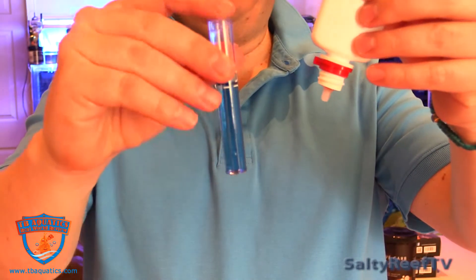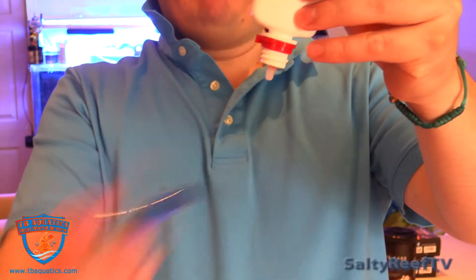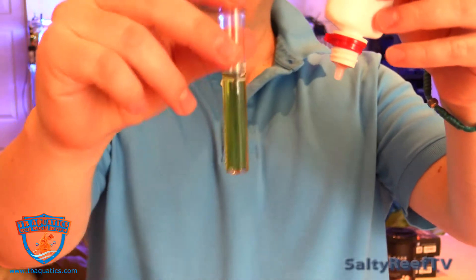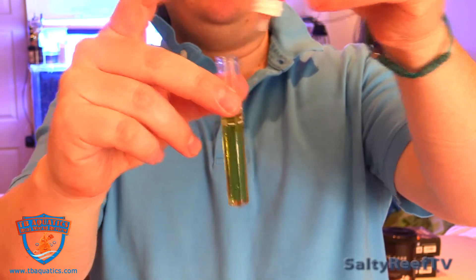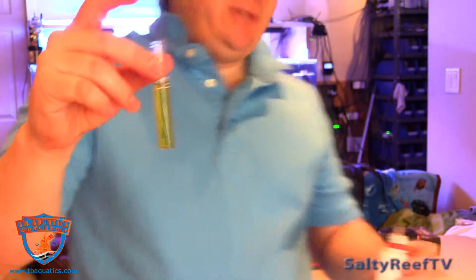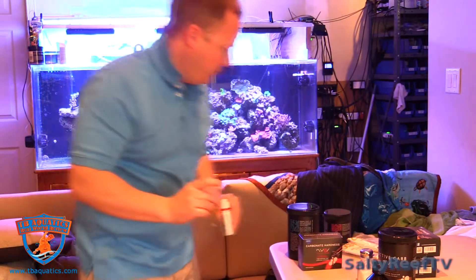I always cheat a little bit. This is the starting color. Counting drops — eight, nine — it's starting to change already at nine. Let's see if we get a more pronounced color change with the tenth drop. Not really. So I've been measuring with this for a while, and now I'm confused about what my KH value really is — is it nine or ten? According to API it's nine; according to the NEOS test kit it's ten and a half.